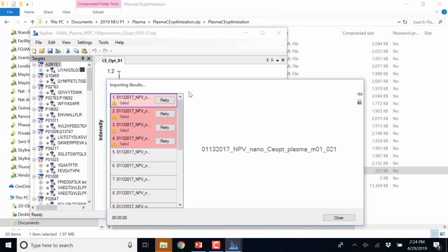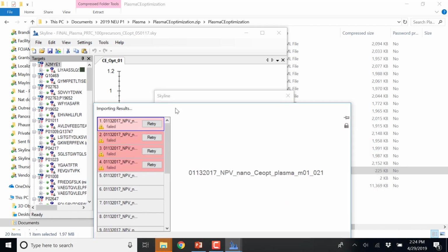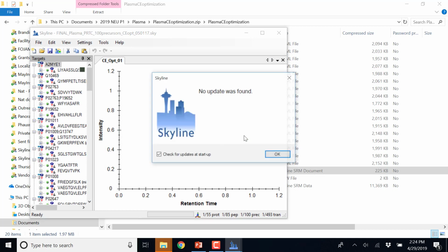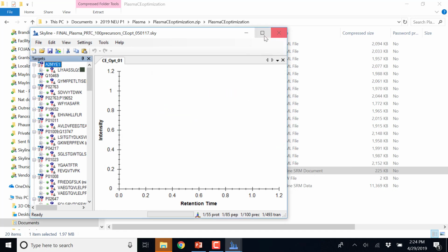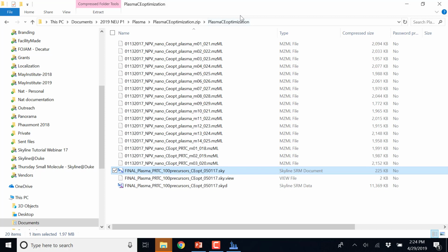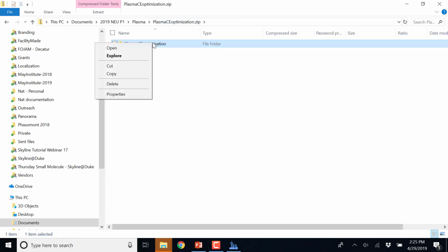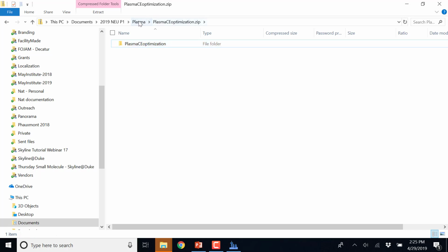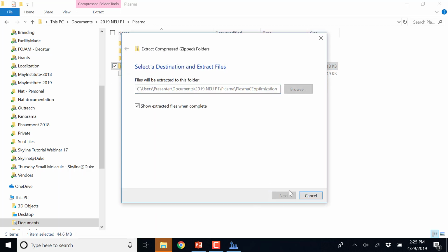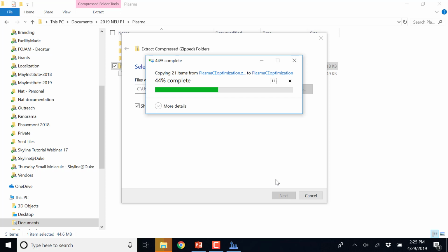All right. Yeah, so for some reason this is disconnected. That's all right. Yeah, it could be because it's zipped, you're right. Let's see. All right, let's try that again. Yeah, it's working on it. Oh, thank goodness, okay. I just extracted to the same folder. Yep, okay. So if you haven't extracted, extract it. This shouldn't take too long.